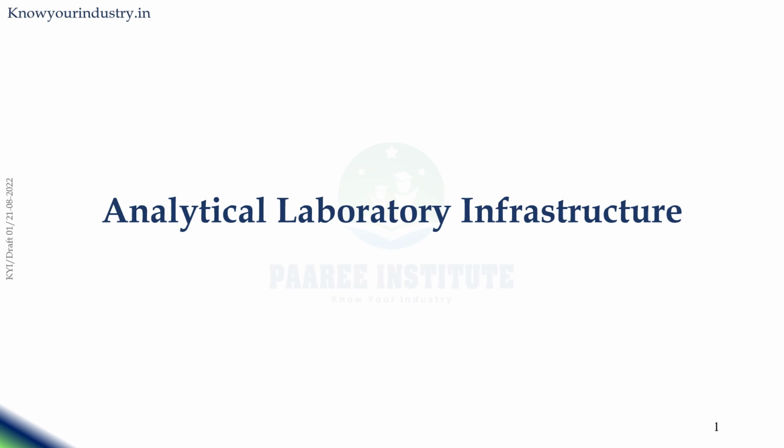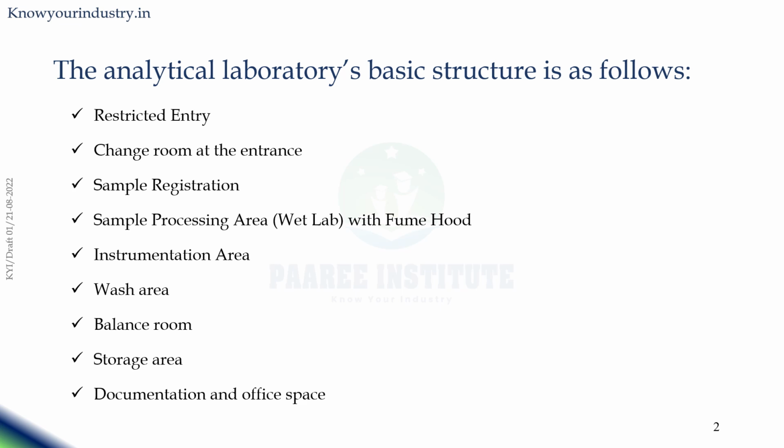Hello aspirants. So far in this course, we have seen what is analysis, analytical chemistry, and what is pharmaceutical analysis. And now we are going to see about the infrastructure of an analytical laboratory, how it is constructed. An analytical laboratory will have different parts, different areas.